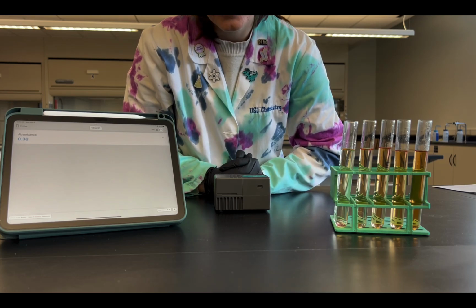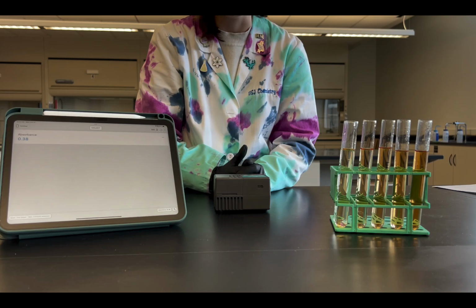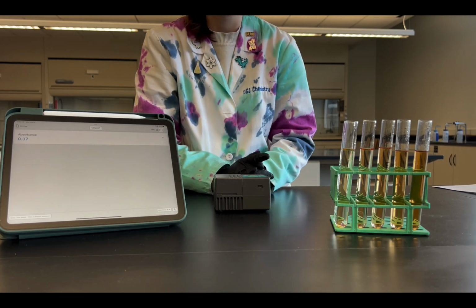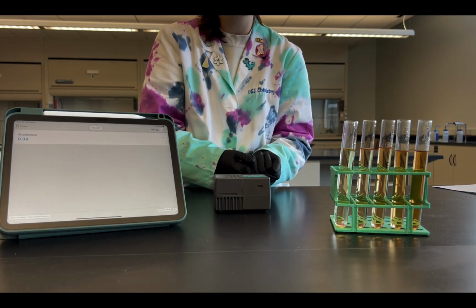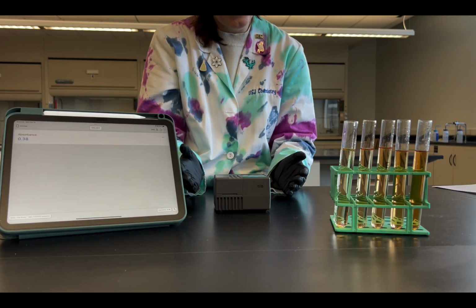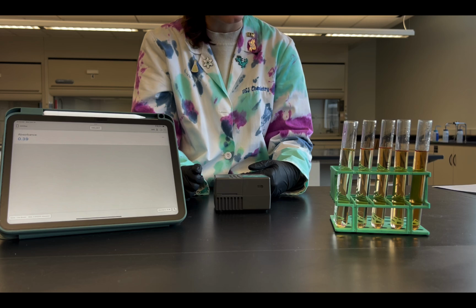And there we go. So we see that our absorbances are going up and up and up with each solution. If you are completing this lab in person, just like I am, and actually have these solutions in front of you, and say 2 of your solutions have very similar absorbances, that may be a little clue for you that something went wrong, and maybe one of your solutions was not at the proper concentration.